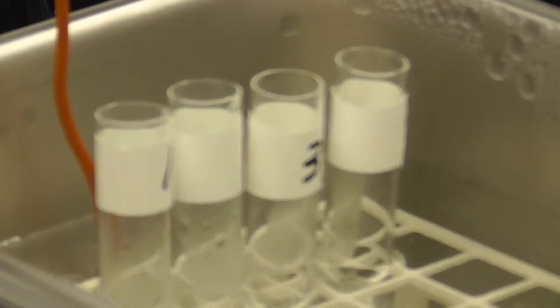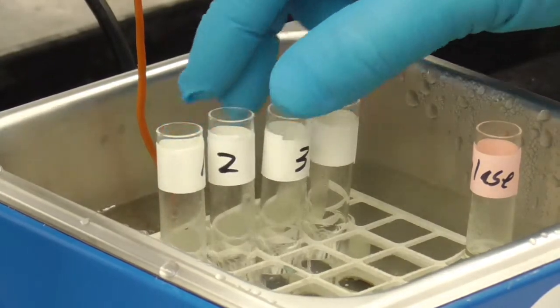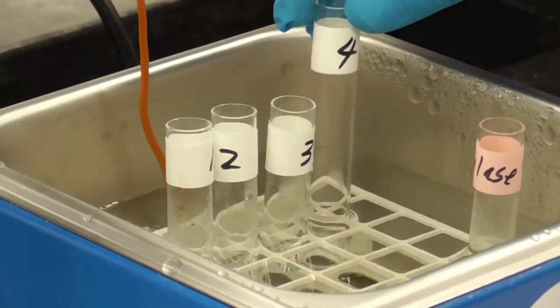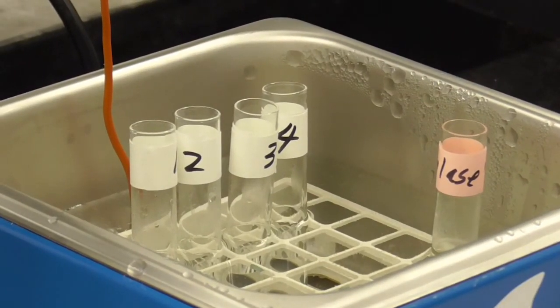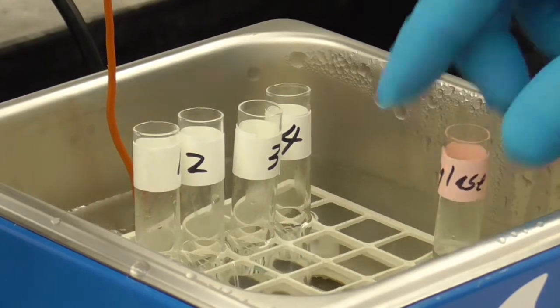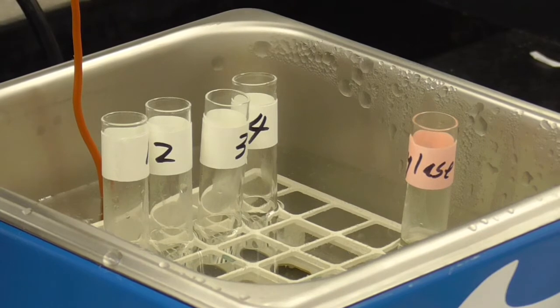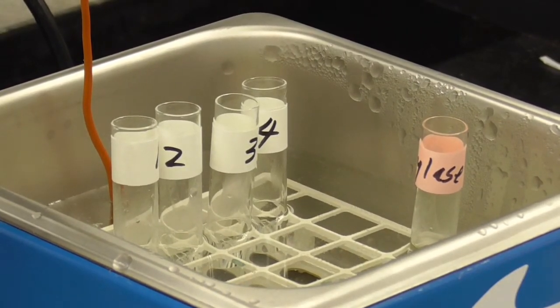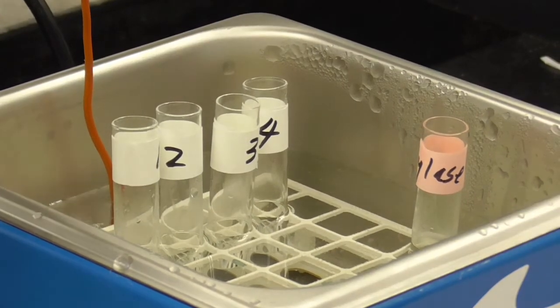That's going to be our control test. In test tube number 2, we're going to put 2 drops. Test tube 3, 4 drops. And test tube 4, we'll put 6 drops. So 0, 2, 4, 6. We're going to increase the amount of enzyme, and remember, here's my enzyme right there, in each one of those. And it's all at 37 degrees right now, so it's at body temperature. It says, go ahead and put the drops in, and then step 7, immediately transfer 4 drops of each one of these solutions to the test plate and observe the colors.